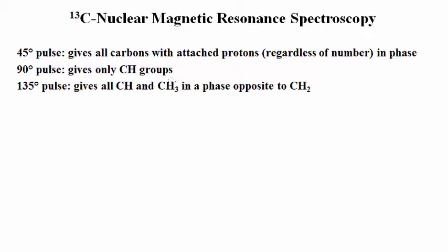So the actual physics that are responsible for how this technique works probably isn't that important for this. It's a bit beyond the scope of this course. However, it's very easy to interpret these spectra, and given them in a problem or an exam, it's very useful to determine molecular structure.